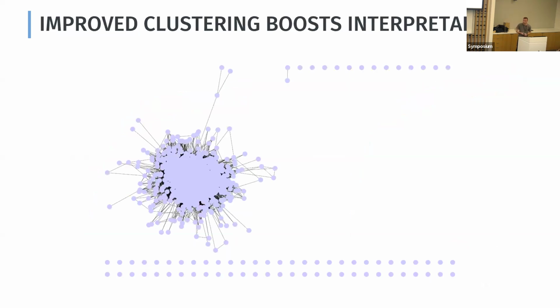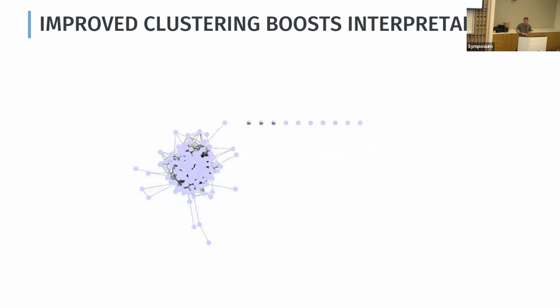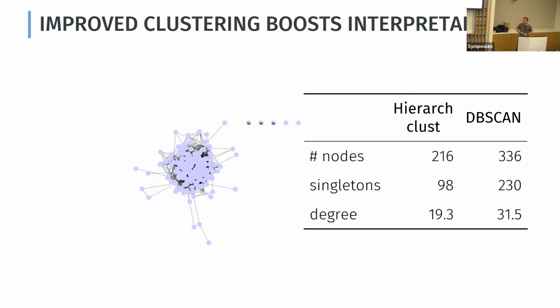And if you use this for subsequent molecular networking, we had our hairball initially. If we now use our optimized spectral clustering, the network will look a little bit like this. So, you know, it's still a lot of information, but it becomes a lot more manageable. And actually, we can quantify it a little bit better.